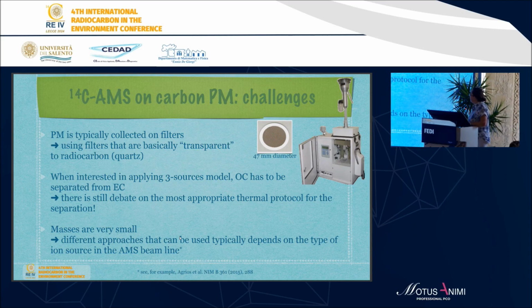When interested in applying the three sources model, the organic carbon has to be separated from the elemental carbon. And this is not trivial, this is really still tricky, because there is still debate on the most appropriate thermal protocol for the separation. We can apply different temperatures in oxygen and or helium atmosphere, but there's still no consensus on which recipe we have to apply, and so this is also a challenge for the future.